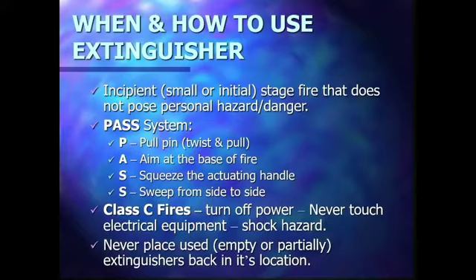The fire extinguisher is probably 3 to 4 kg. A big guy like Arnold Schwarzenegger or a bodybuilder would not have a problem carrying it. But we may have small people, skinny people, and it's very difficult for them to carry. I've been through all this, and I've seen so many people handle it the wrong way, and it may cause an accident, and we wouldn't like that to happen.